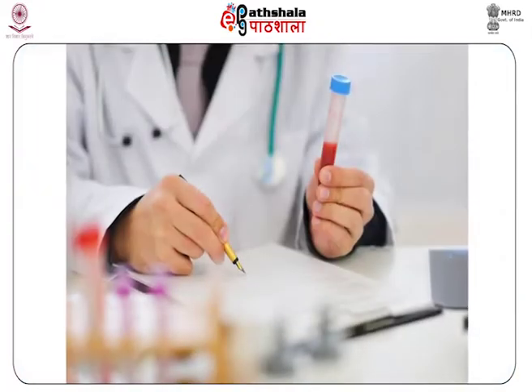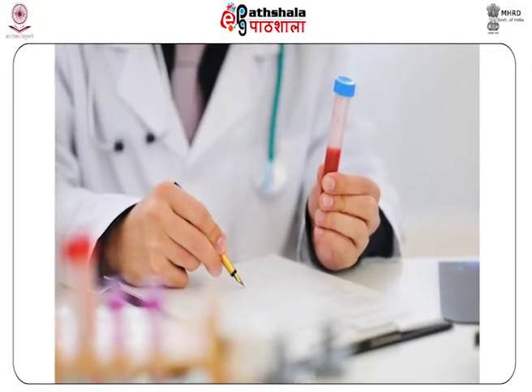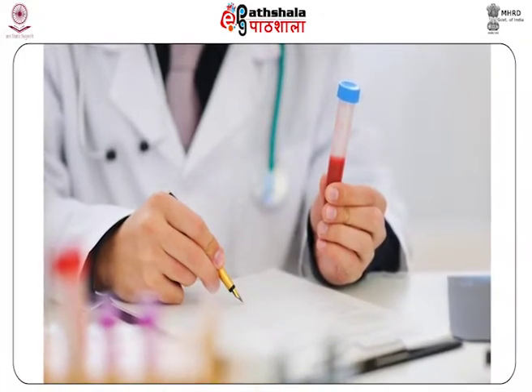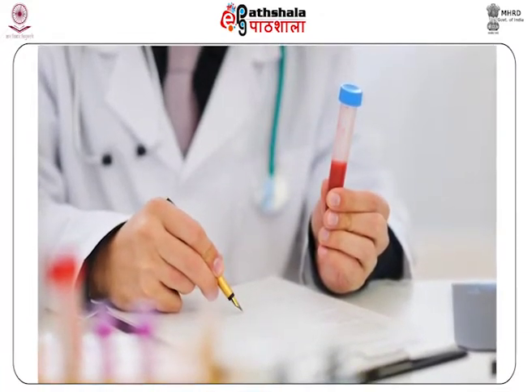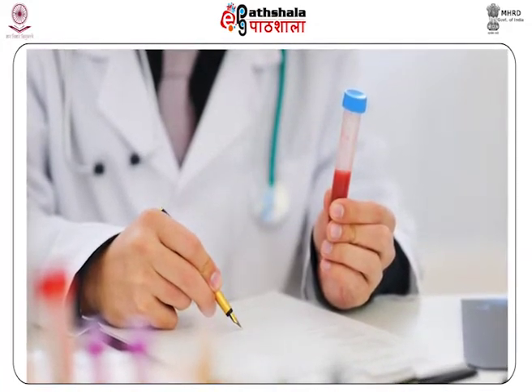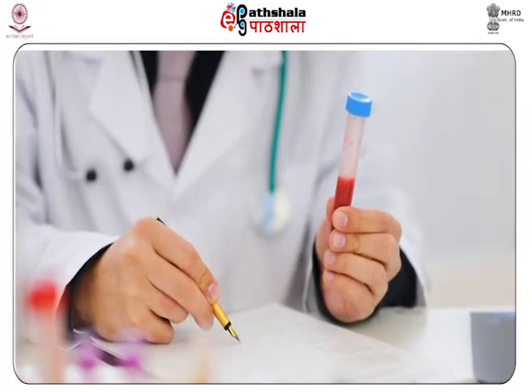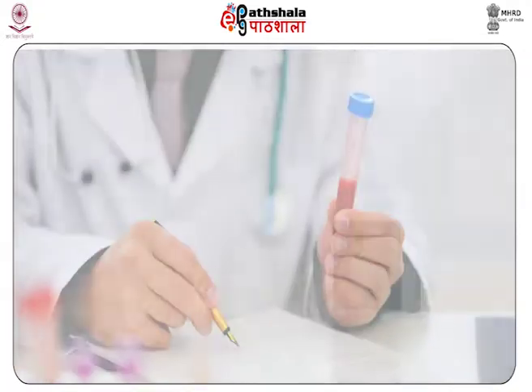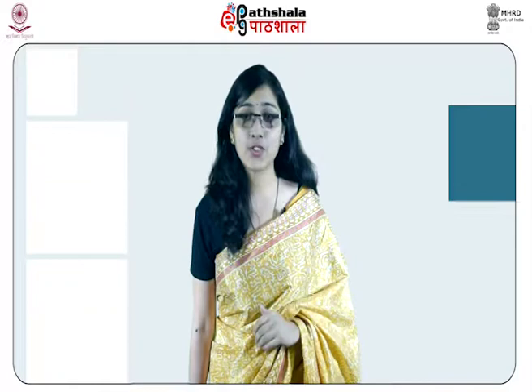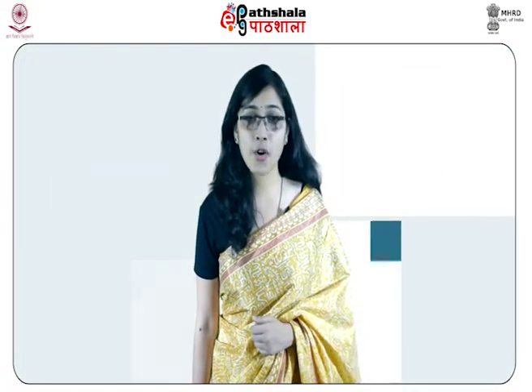The evaluation of blood evidence is a difficult task. An experienced expert handles the work. The collection of blood samples from suspects and victims is necessary for reference. These samples consist of liquid blood. Qualified medical personnel should always collect blood. In case the person has received a blood transfusion, then the forensic science laboratory should be informed.